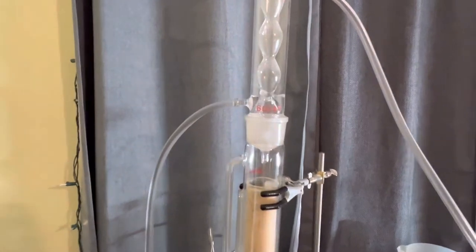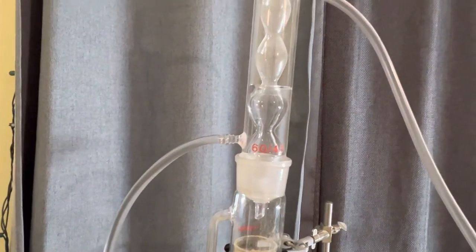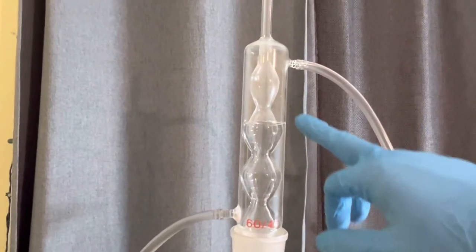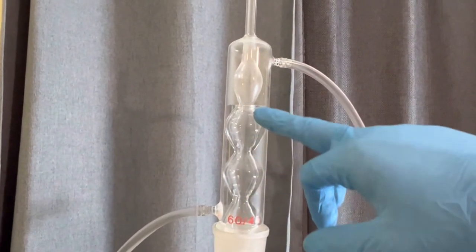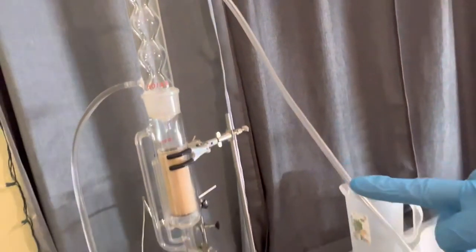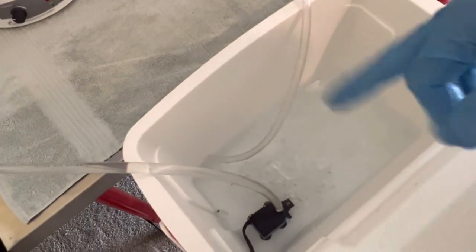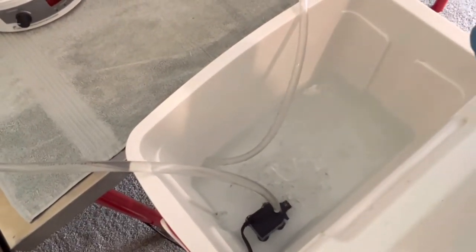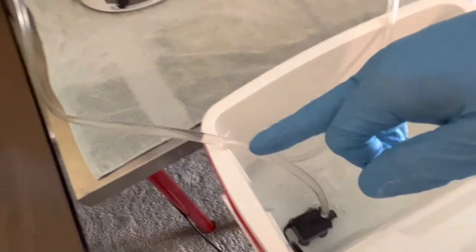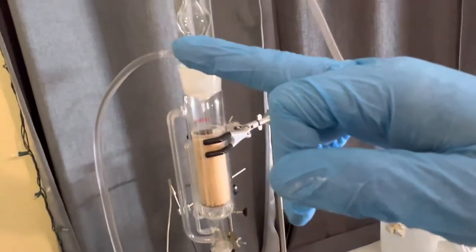And as you can see here, this is gonna fill your condenser up. It's gonna make this, your condenser, cold. This water recycles back down into your cold water storage container, however you rig it up. There's a whole lot of ways. You've got your pump down there running, bringing your water all the way in.